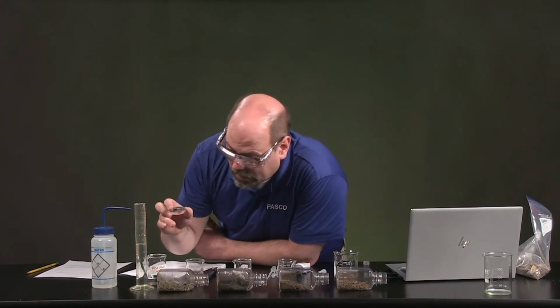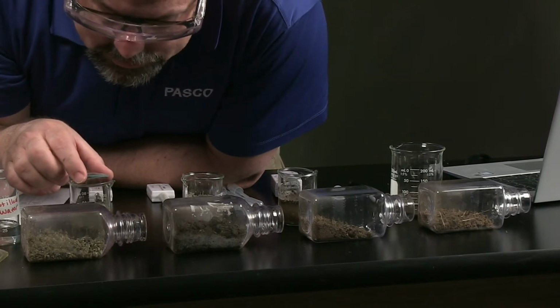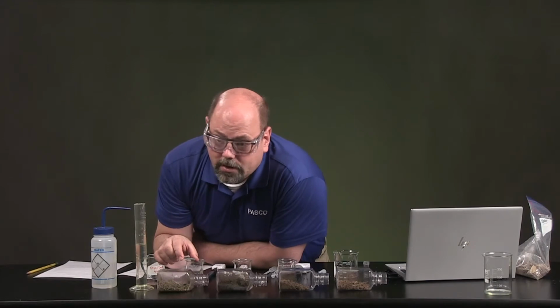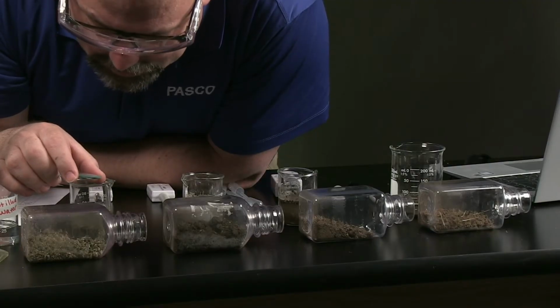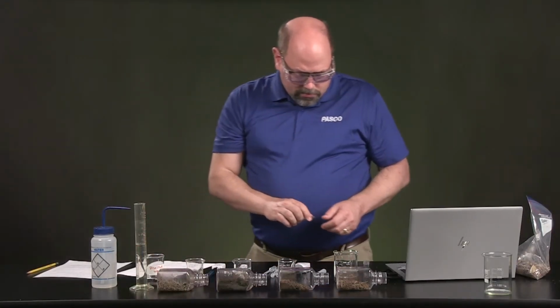Was the potting soil, and the last one was down by the river. And if I take a look here, I can easily see larger sections of sand, gravel, and they have different colors like quartz, which is white. It's got a little bit of pinkish to it, so that's probably the feldspar crystals. But I can see all sorts of different size little rocks that are inside of that stream, which is great. It rinses quickly so that the water can pass through there.